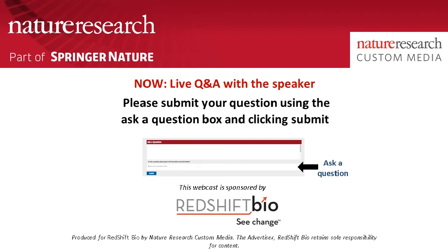Yeah, I think I will take that question. Usually the big challenge when you use IR spectroscopy to determine the secondary structure of protein is the water band subtraction and the water vapor subtraction. Our MMS technology overcomes that by using an auto-referencing mechanism, like I explained a little bit in my brief introduction for the MMS tool.